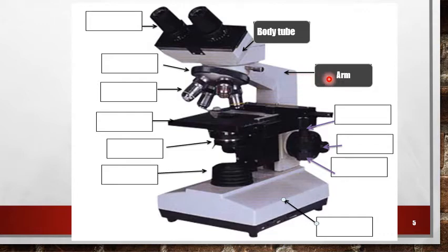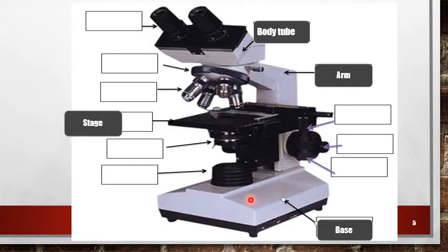The second part is the body or arm, used for holding of the microscope. The third part of the mechanical body is called base or foot, used for standing or supporting of the microscope.